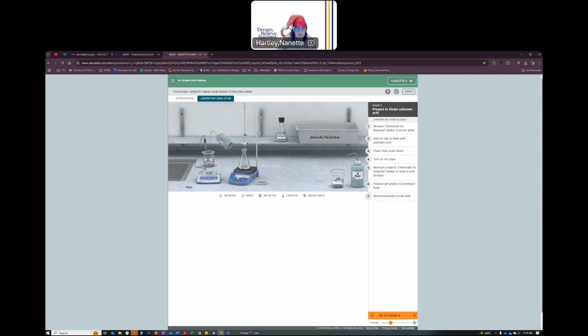Oh, wait, I got to clean it first. Clean that. And then position it here. I don't like the way they position that. I would never put it just like that. I always have something holding it.